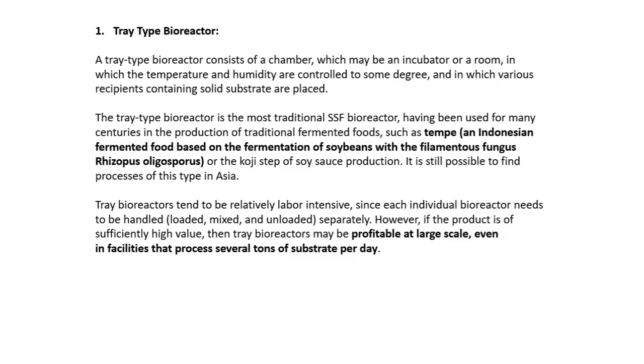The tray bioreactors tend to be relatively labor intensive, since each individual bioreactor needs to be handled, loaded, mixed, and unloaded separately. So this is a very ordinary method. This needs some manpower to clean the trays, load the trays, and fix the trays within the chamber. Everything requires manpower. That is why it is labor intensive, and more labor is required.